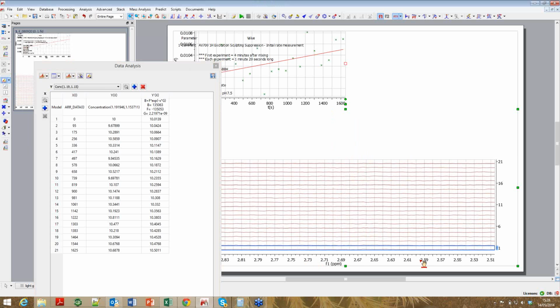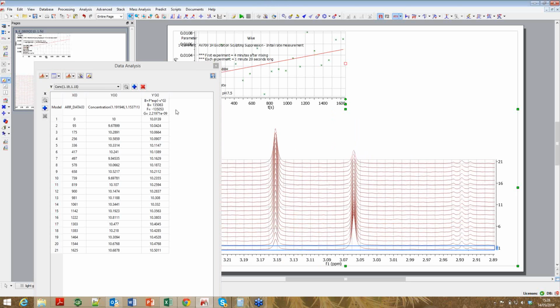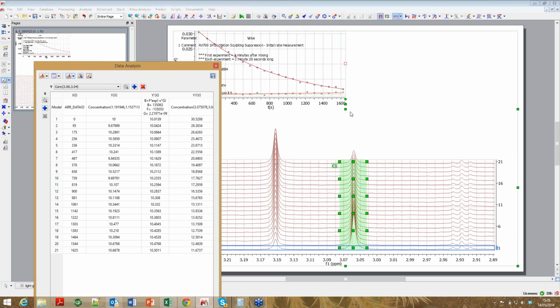So now when I ask it to look at one of these multiplets, singlets, it's just going to ask me the number of nuclides. So there we go. That's another way of doing it. And as before, you can make the line from the first one invisible, like that. Okay, I think that's all I had from the enzyme reaction.